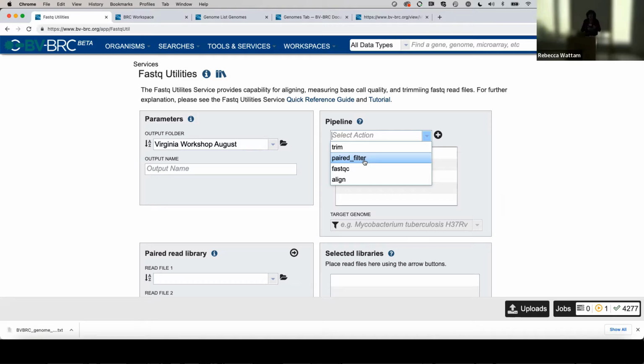That is going to throw off the assembly service, also the variation service, sometimes the RNA-seq service. So people's jobs would fail, they would write to us, we'd look at it, and we would go in and manually create them to be equal for them. But now we add this service.